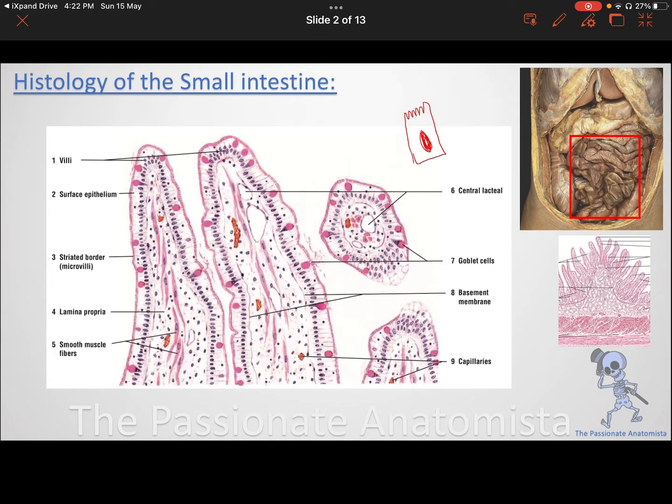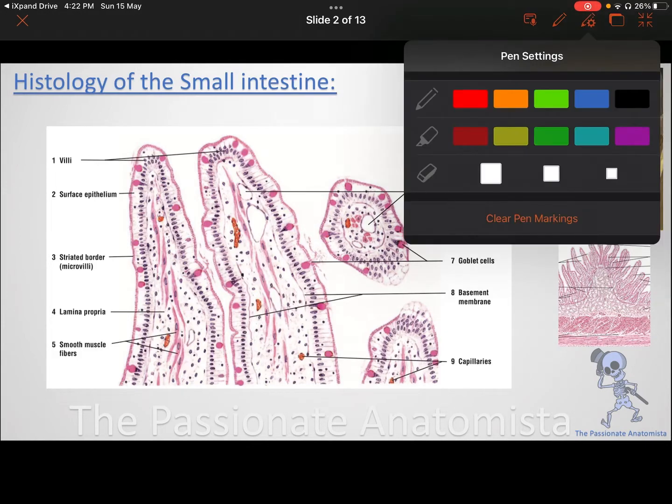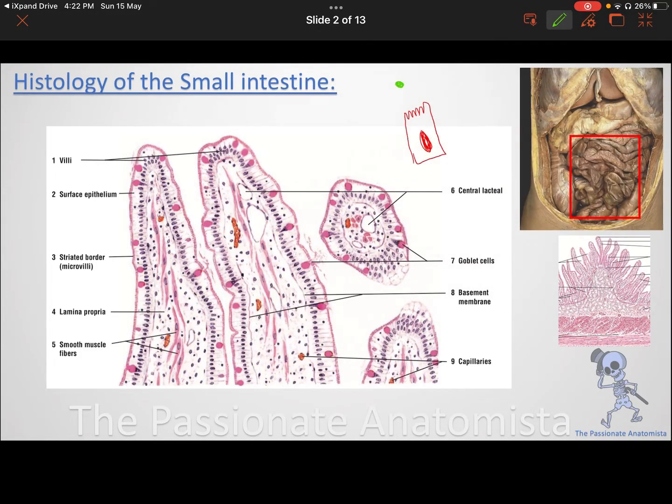During digestion you have your fatty acids. Your fatty acid comes into your columnar cell. It gets in, and by the Golgi it forms the chylomicrons. So that was the fatty acids of your fat, and here by Golgi you convert it into the chylomicrons, and the chylomicrons are going to come out of the columnar cell. Can you see these columnar cells with the microvilli? This is your lining epithelium. All these are your columnar cells.